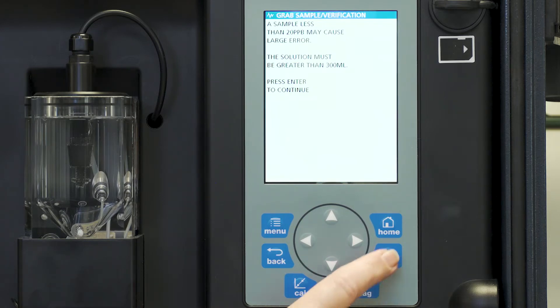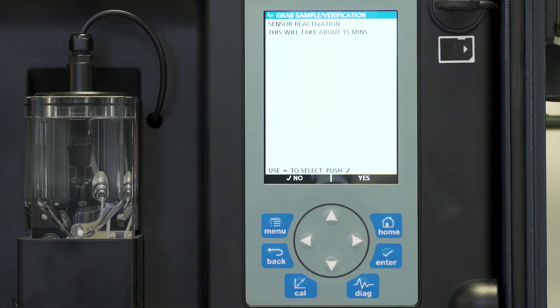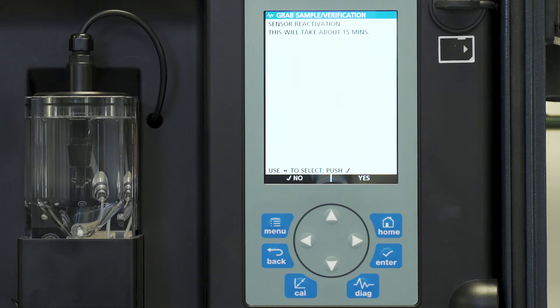Now we're ready to press enter to continue and the sensor reactivation will take about 15 minutes. We want to then proceed.